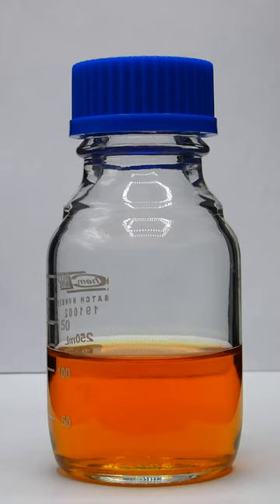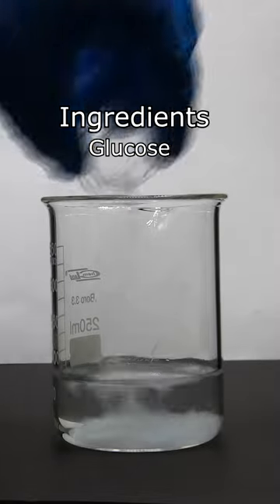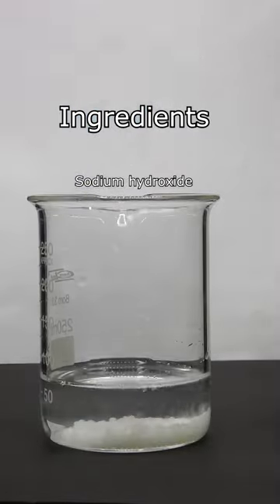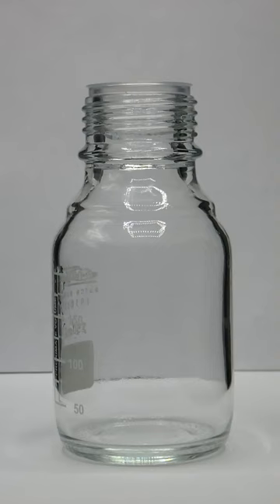So this reaction is called the traffic light demonstration and can be made by first dissolving some glucose, sodium hydroxide, and a dye called indigo carmine in water, and then adding the solutions together.